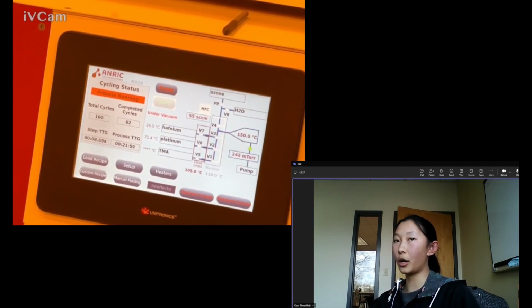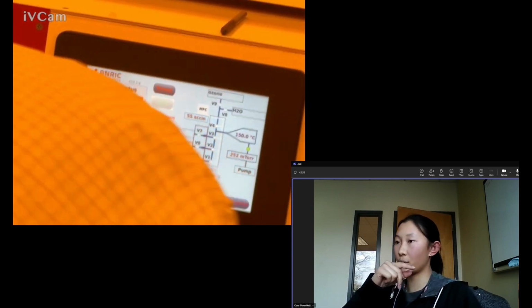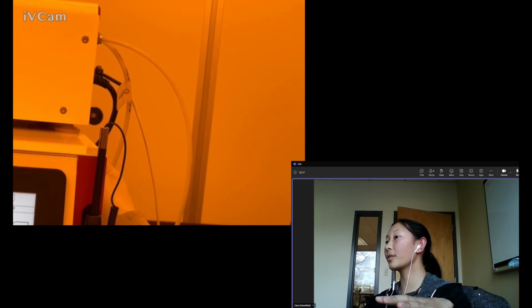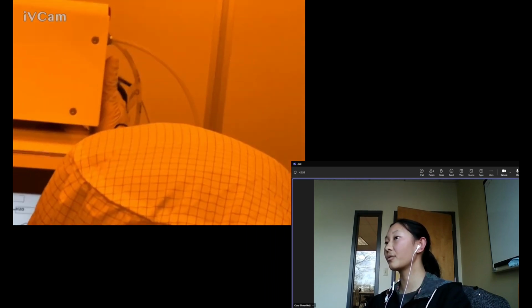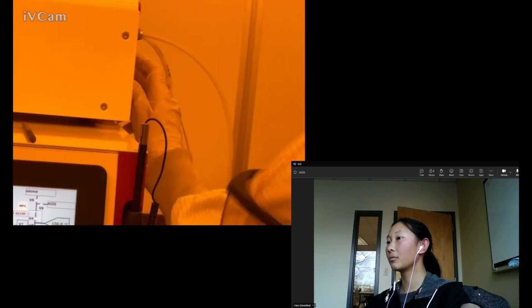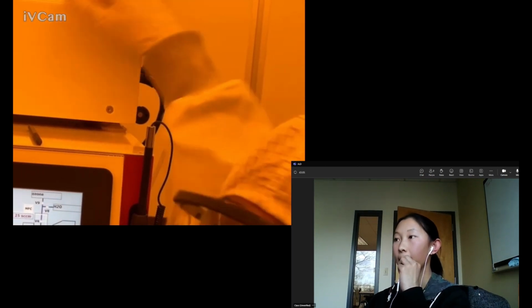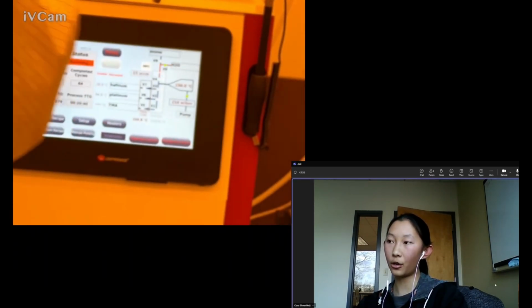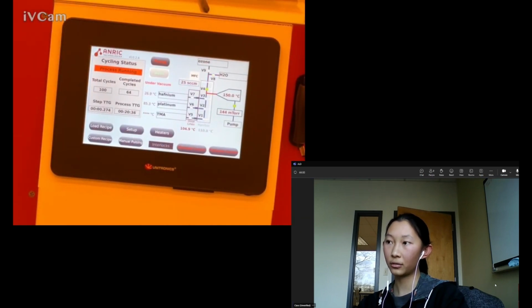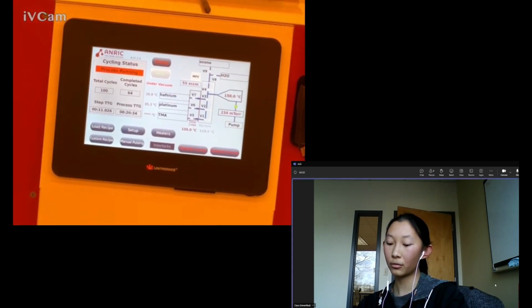Oh yeah, so you're going to turn it on using the power switch underneath the power cord. Wherever the power cord is coming in, that switch. Oh, the power cord. Okay. That's powered. So you're going to want to switch it on at the power cord, and then also switch on the toggle. The red toggle. There's two. Okay. Ozone.